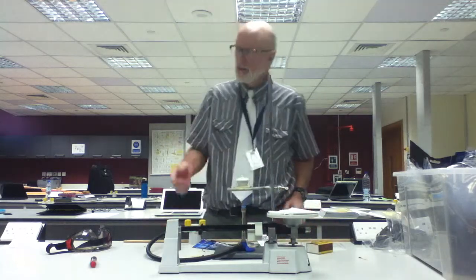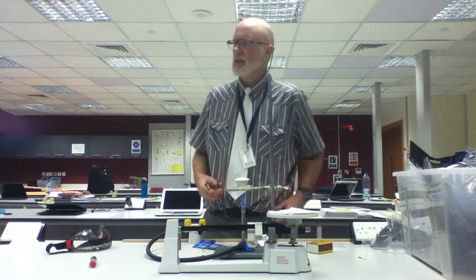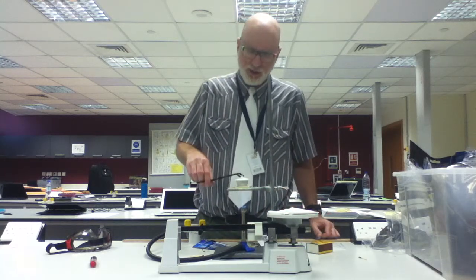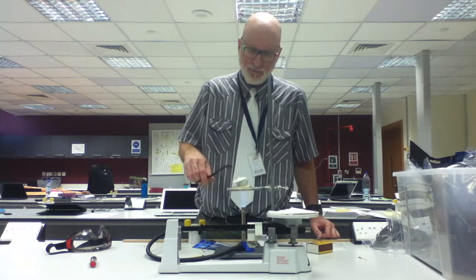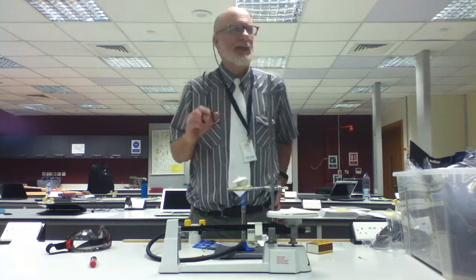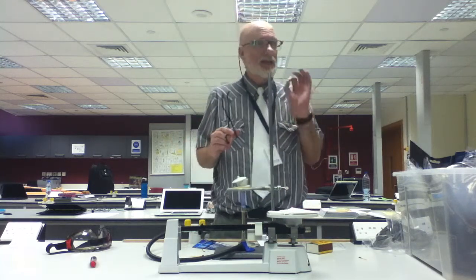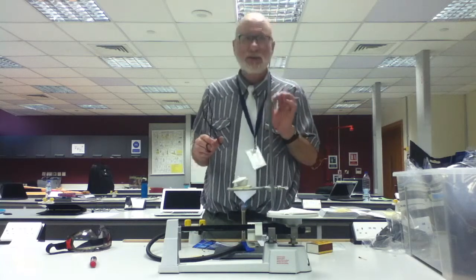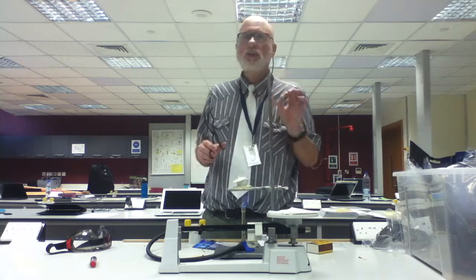Okay, so now it's cooking, and you leave that on for, say, 2 or 3 minutes until it gets nice and hot. Then what you're going to do is take the lid and go like that. Okay. Now what I did was I made a mistake. And it's a mistake that I purposely made because you're going to make the same mistake, but you can't. All right. What did I do wrong?